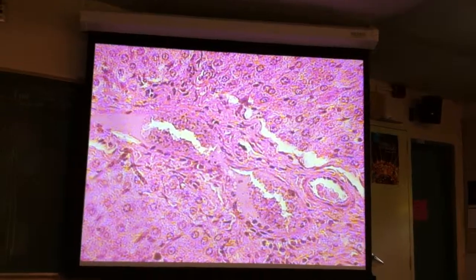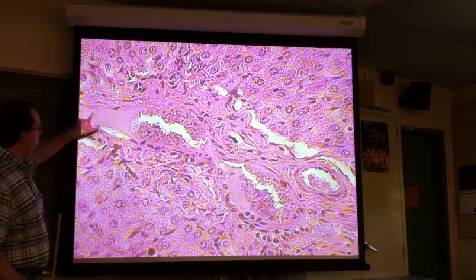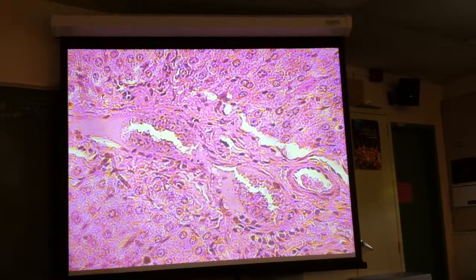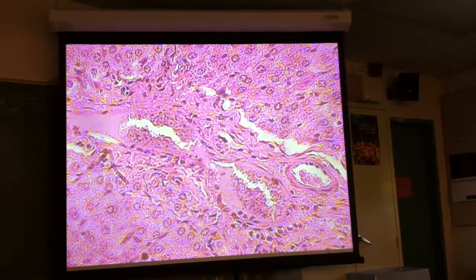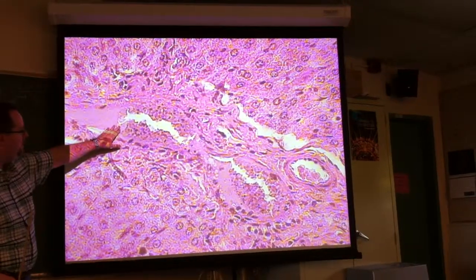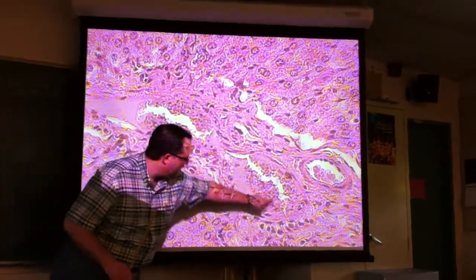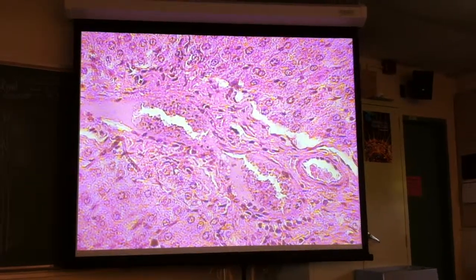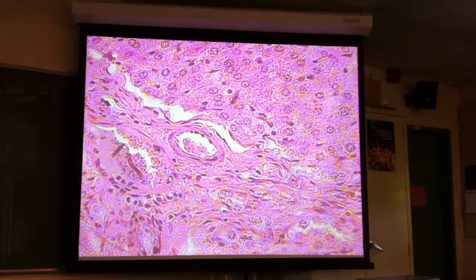It looks like we have kind of a weird vein right here. This appears to be connective tissue right here. Imagine a blood vessel that's just slightly lifting out of the plane and then diving back in. And imagine that we're cutting through the tunica externa in portions of that. I think that's what this is. And then we're seeing a bit of lumen, and it's rising out, and it's diving back down right here. This is lumen as well. So that should be hepatic portal vein, although it's not a good one. But that artery down there, that's textbook perfect right there.